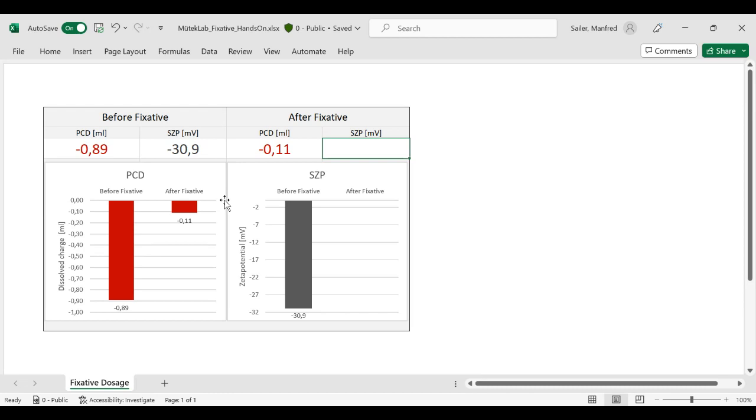And you could conclude now that our fixative dosage seems to be a major success because all anionic trash is gone. So obviously, we are first takers. Our first tried fixative dosage seems to be just the right one. But needless to say, we have another instrument here on our laboratory table, and we should include this one as well. And we should definitely draw only a final conclusion after we have double-checked the charge on the fibers. So, this is what we do now.